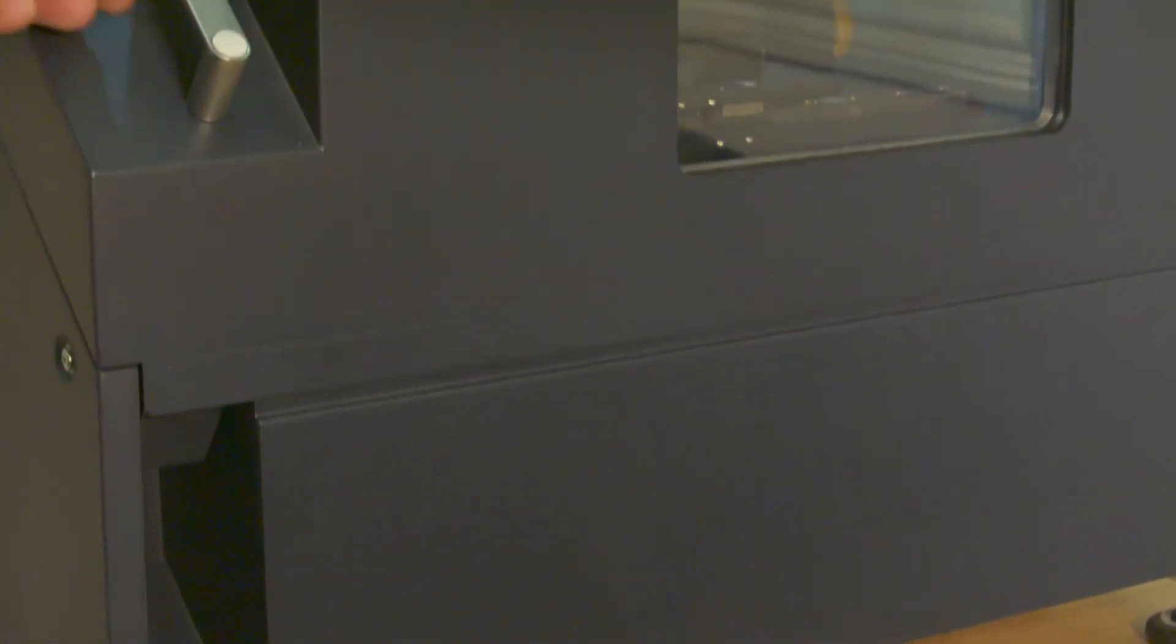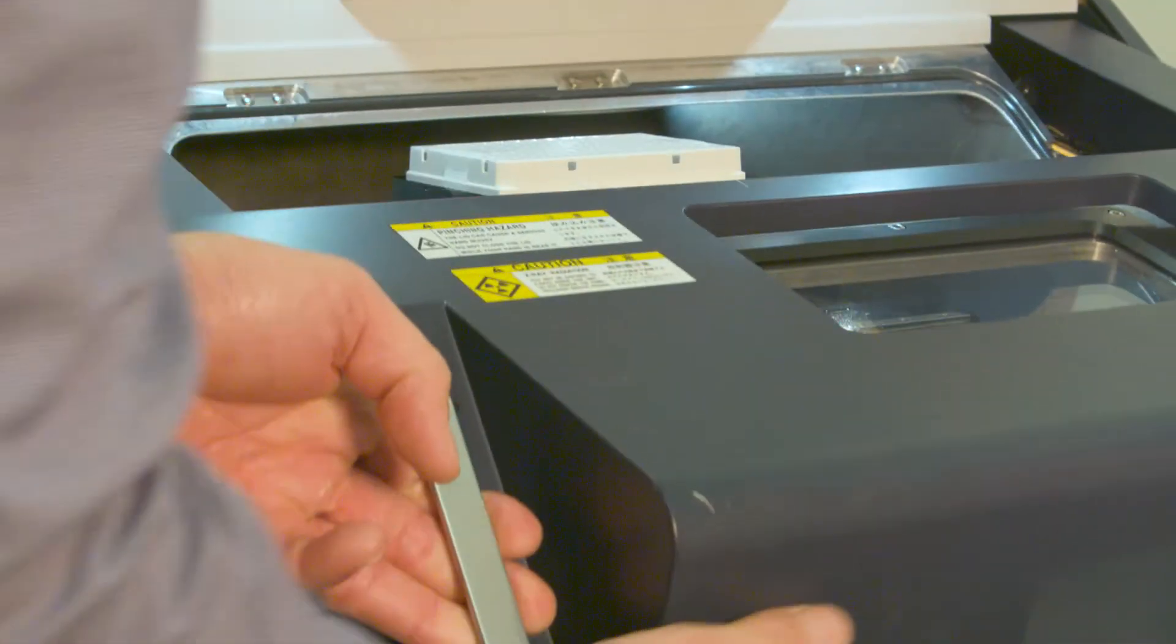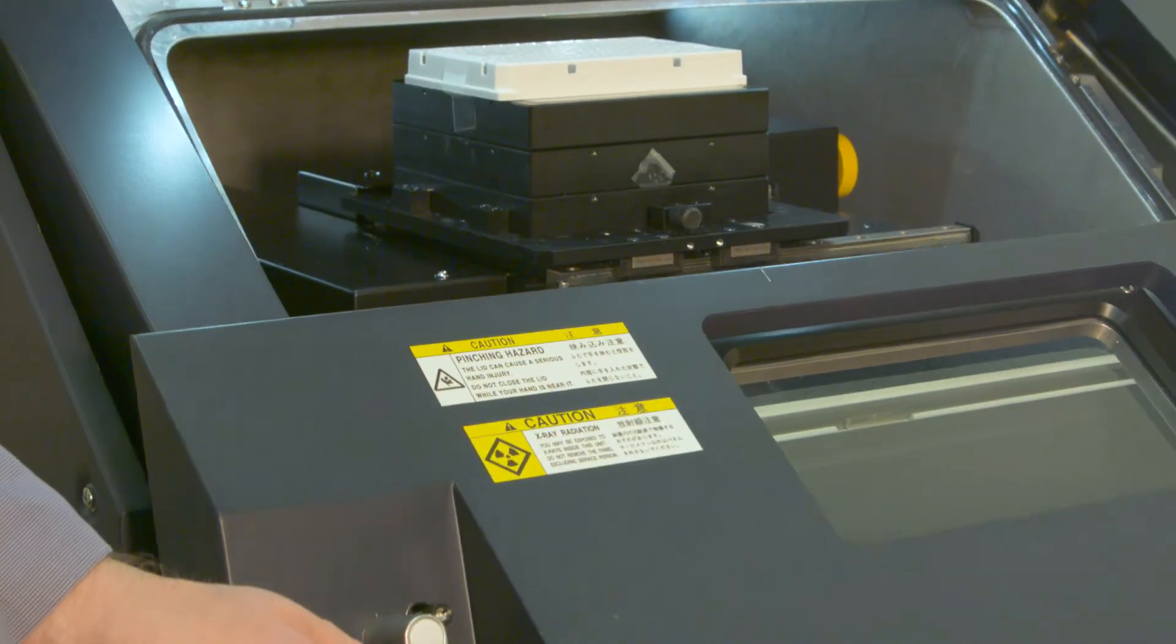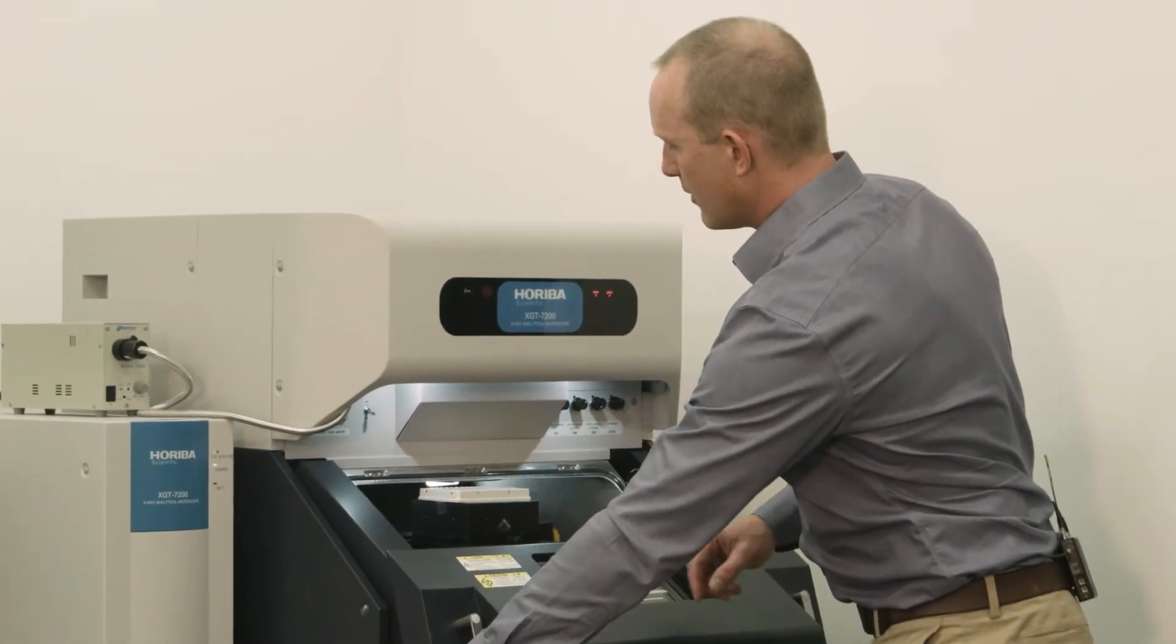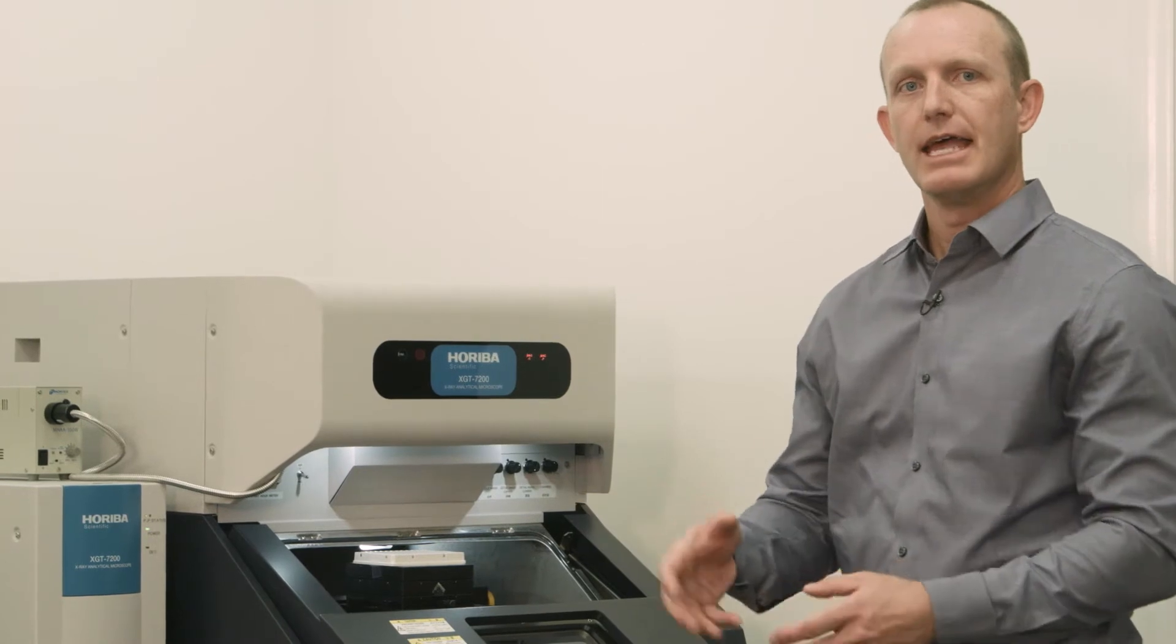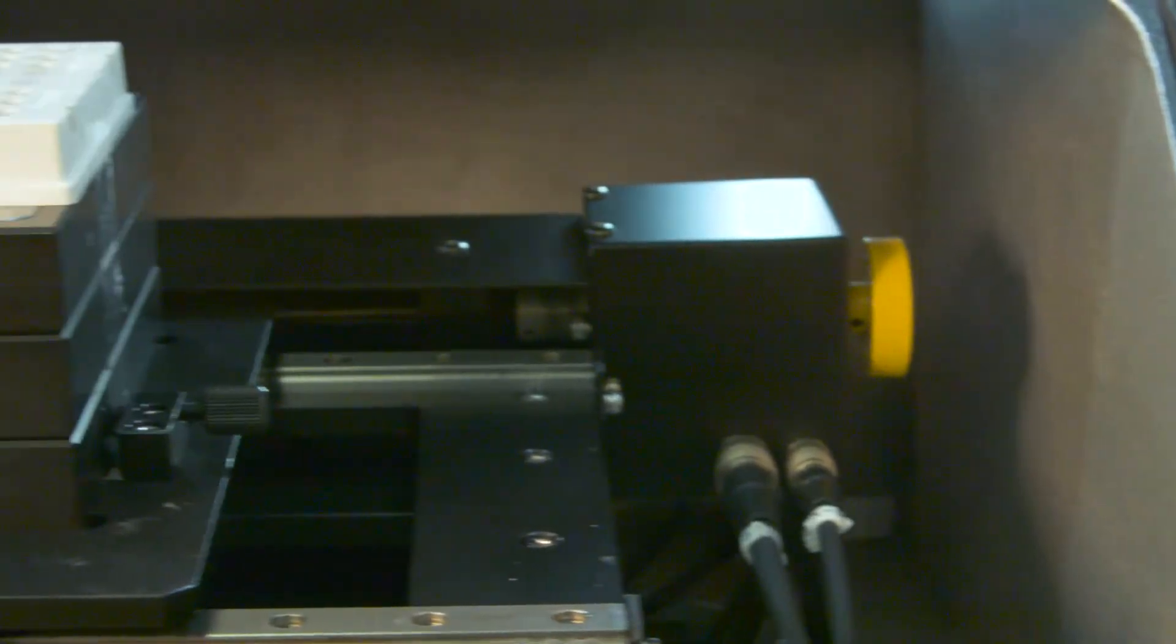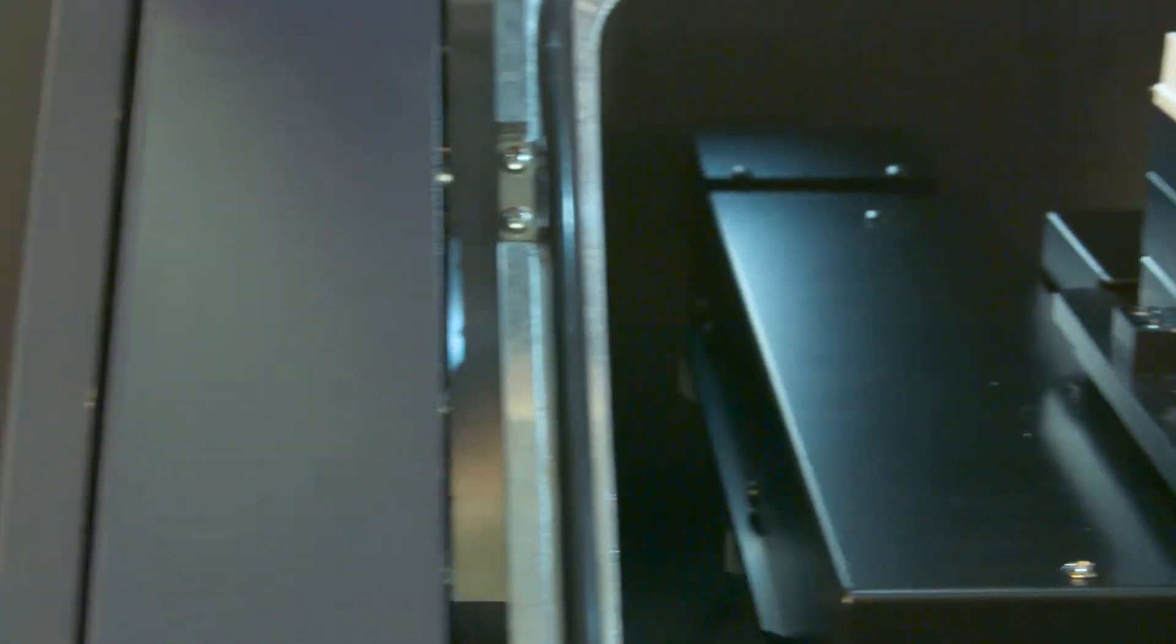With the Raman spectrometer we're able to measure distortions of atoms, bonding angles, and how molecules are shaped in space. With this x-ray microscope we can measure what elements are present. We use x-rays, fill up these wells with our sample, and program the computer to go from well to well. It collects x-ray spectra that give us elemental specific information.